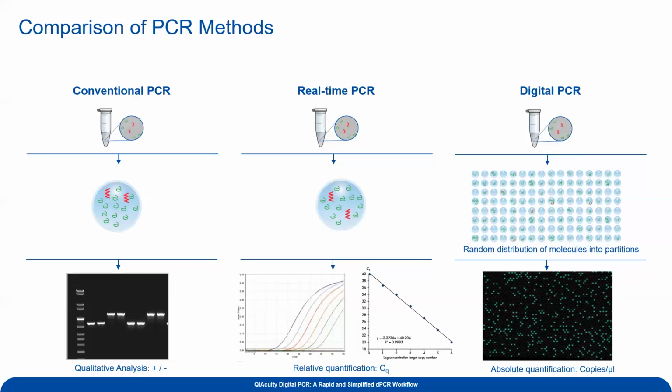So a number of things which affect qPCR's accuracy and analytical capability are the reaction efficiency. So how close are you to a perfect doubling of that template with each subsequent cycle? Things like how well does your standard curve actually match the background of your unknowns? And the further away you deviate from kind of that perfect scenario, the less analytically accurate you are, and you just have this unbounded unknown error, right? So it can really start to bloat whenever you're doing absolute quantification.